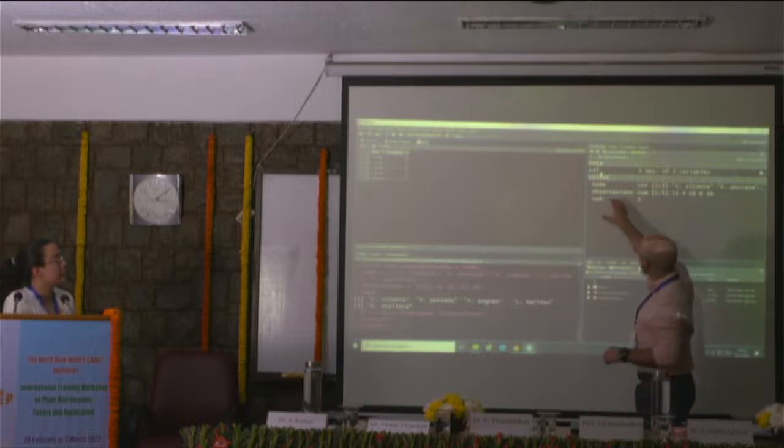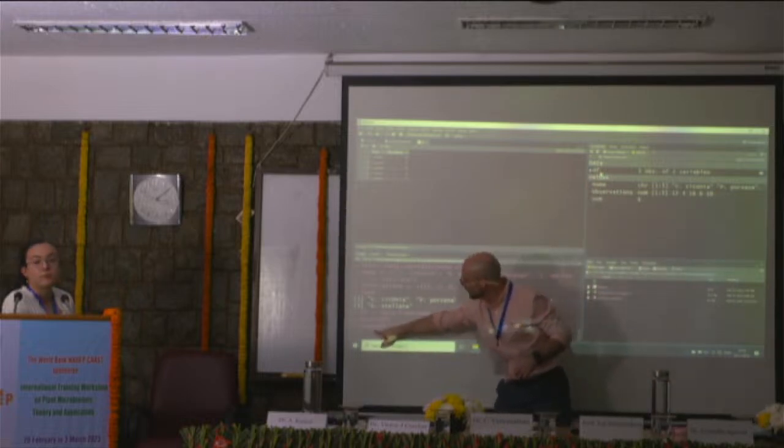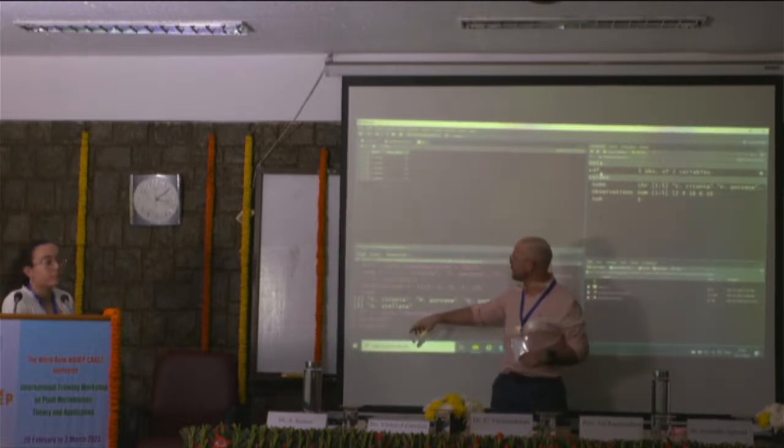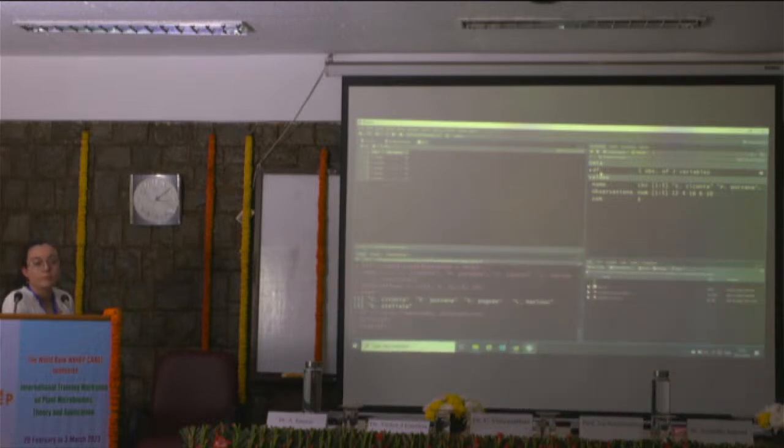So you see when you click here and load the table, in the console there is always a command, view and the data frame, df, in brackets. So if you run that, you will see the data frame. That's another way to open it. Okay, we are all in the same place, right? Everything that we do by clicks, there is a command way to do it, and RStudio will print it. It's not necessary that you know them, but it's good to see what R is doing. Although you can stick to the clicks if you're more comfortable with that.